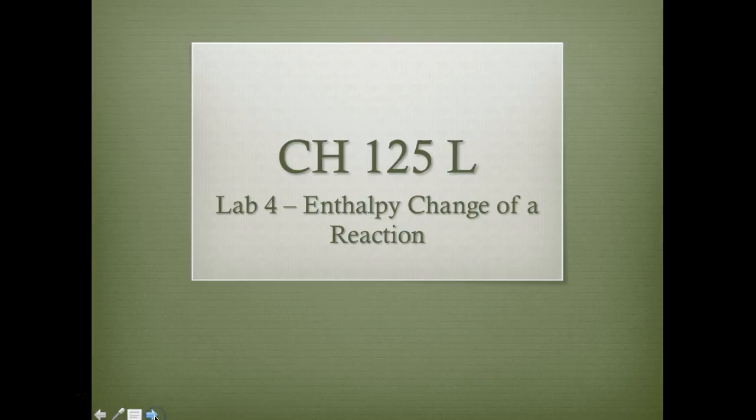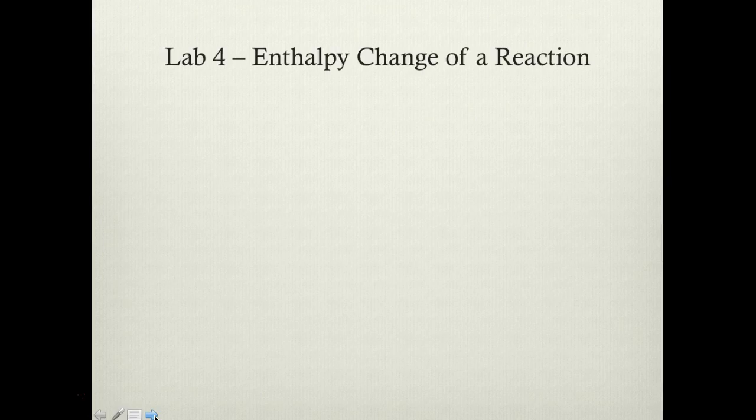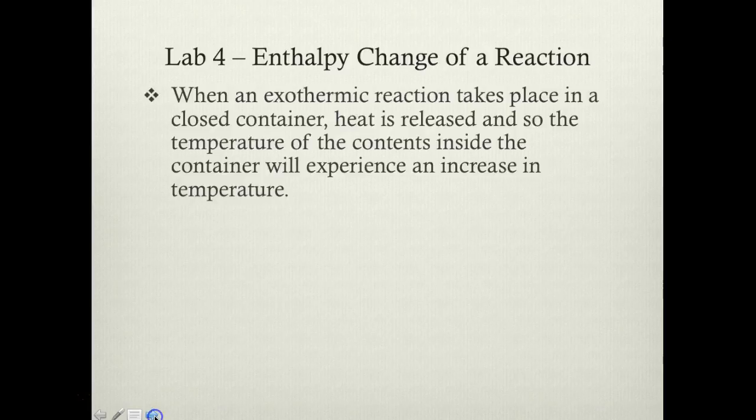So here, what you're going to do is have a reaction happen in a closed container, which is called a calorimeter. And this reaction generates heat, or it gives off heat, and that heat that is given off is called exothermic because the heat is coming out of the reaction.